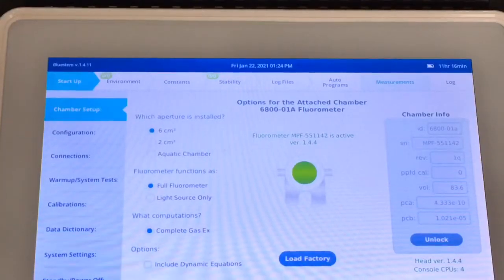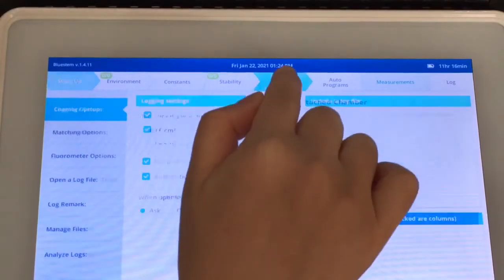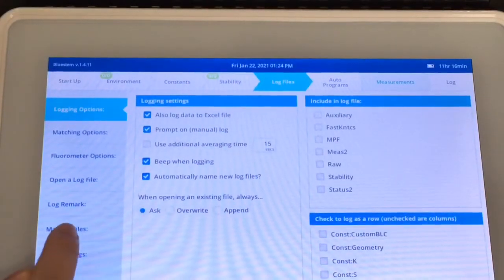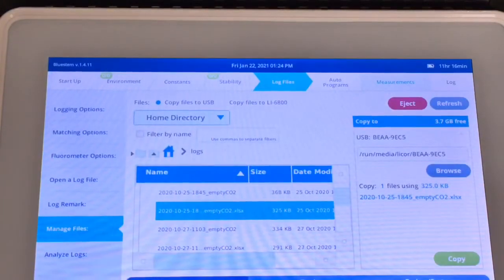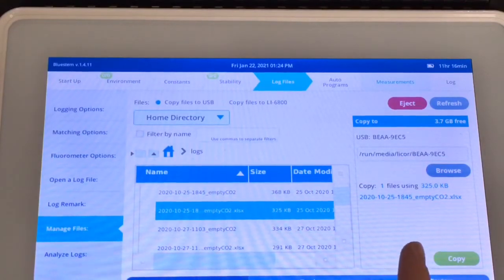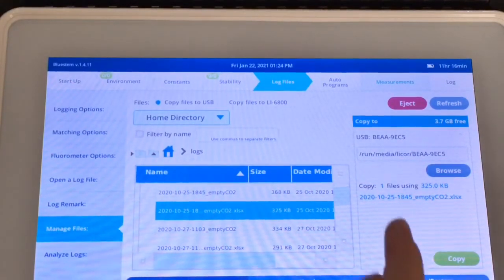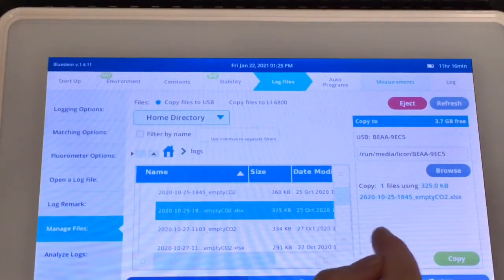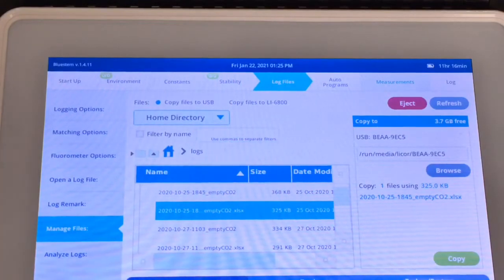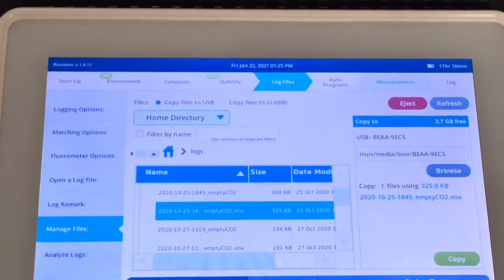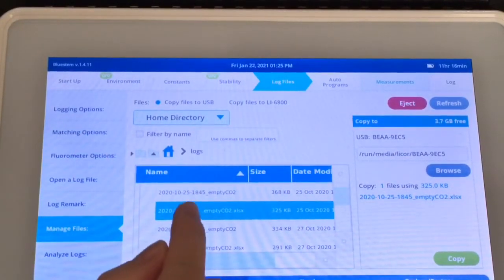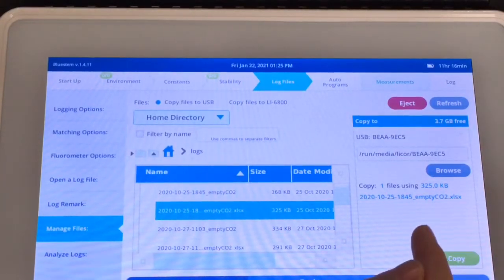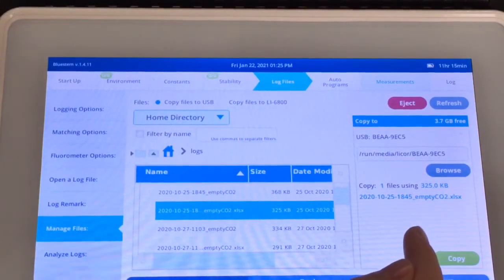In the software, you just go to Log Files, and then Manage Files. You will see your USB storage device is recognized by the instrument already. On your left hand side, that's the folder structure in your instrument. On your right hand side, that's your USB storage device.